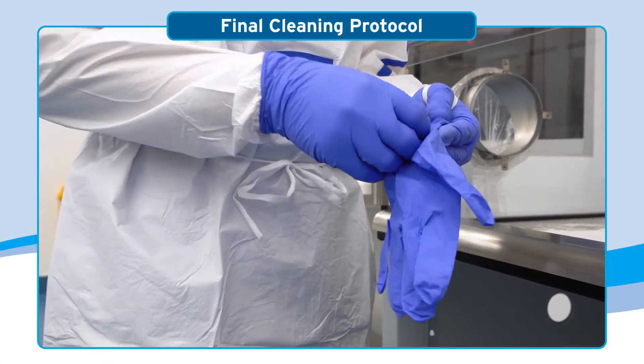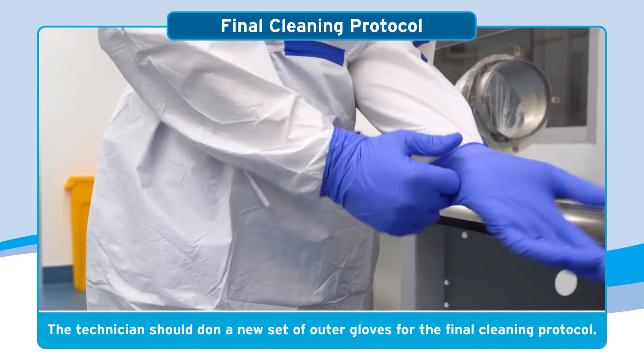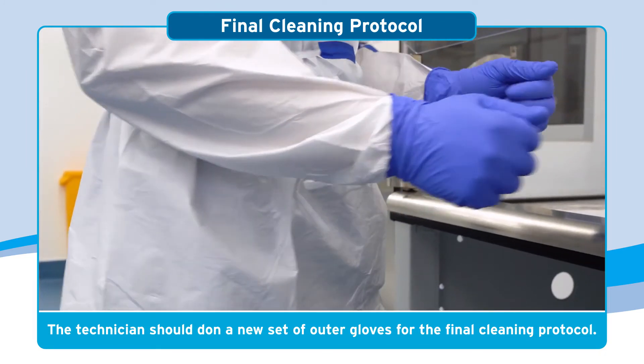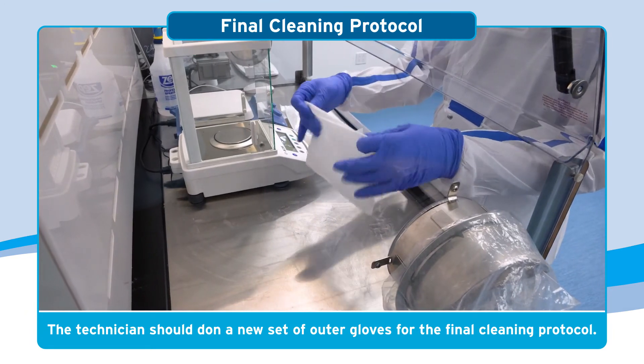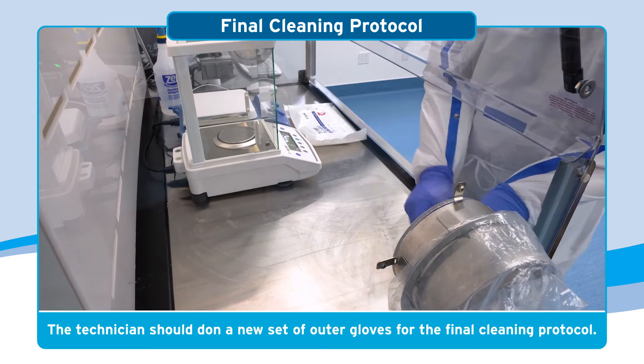When the technician comes back to the CVE to begin the final cleaning protocol, they should don a new set of outer gloves. These gloves will become soiled while cleaning the CVE and must be doffed into the waste chute at the end of the cleaning procedure.